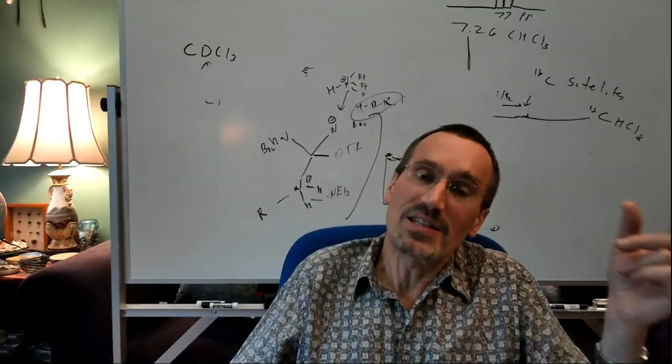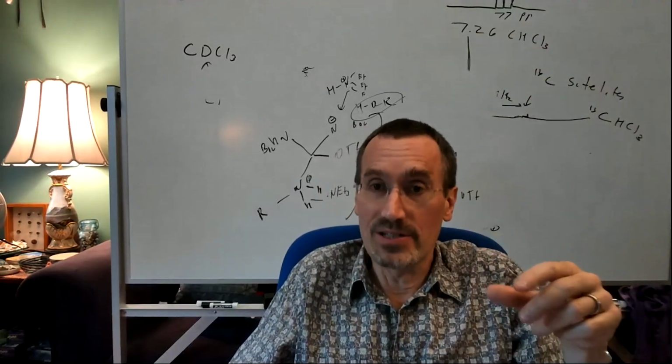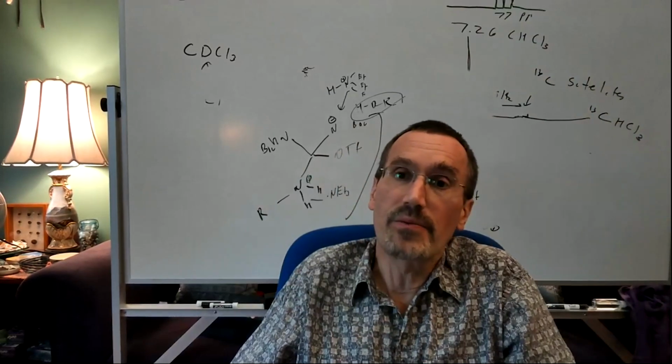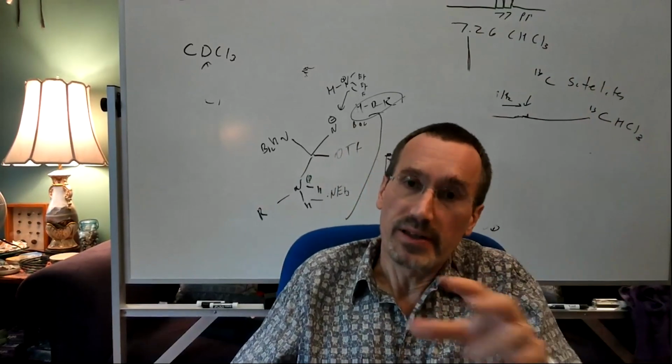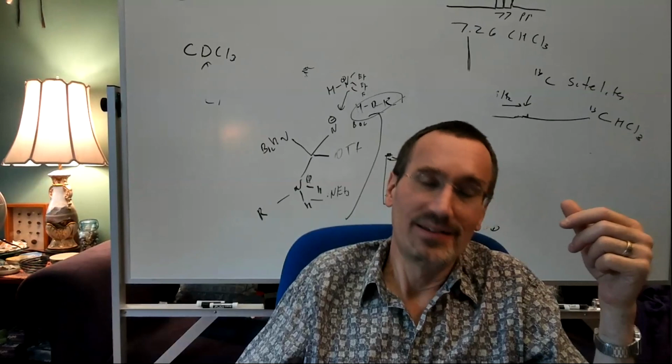Well, I think it's the bromine with the benzene ring. I'm not sure how that, maybe CO2 comes off. I'm not sure. So yeah, the acylium ion loses CO, so that gets you to the phenyl cation. So that was another mechanism that we saw in class. So yeah, that gets you over to there. So further fragmentation of the acylium ion.